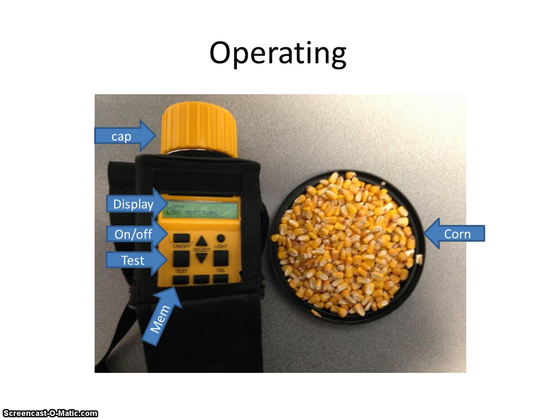It's pretty simple. I'm going to have a moisture meter. You can see there we've got a cap, display area, on-off switch, a test button. We've got a memory button down on the bottom so we can store our values to get an average, and we'll be using corn as our test grain.